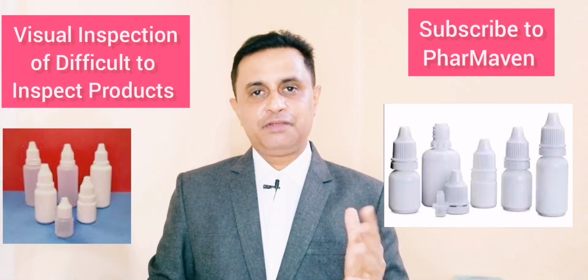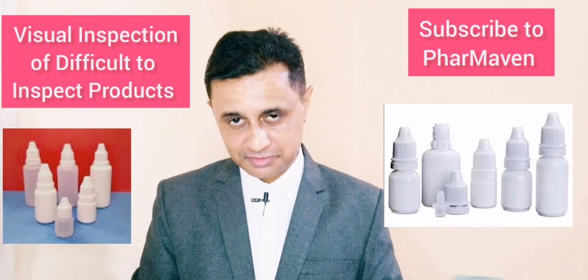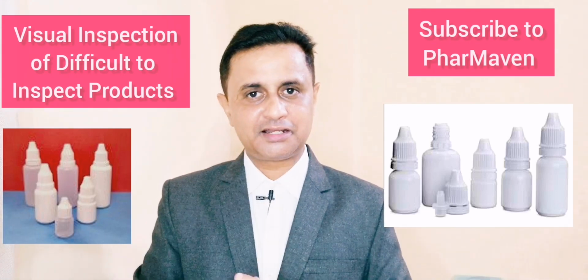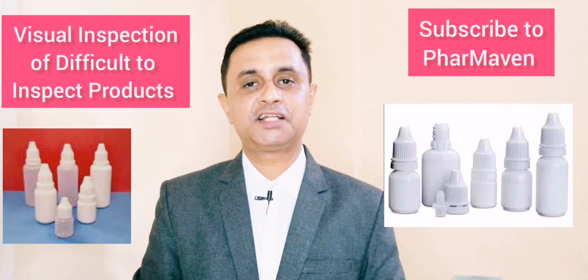Coming to plastic containers, opaque containers. For opaque containers, we may have to go for additional lighting, an extra light source, extra lux, that is 8,000 lux to 10,000 lux. Again, the same process of transferring content to a clear glass vial or clear container can be done to inspect a certain number of containers as per the statistical sampling.